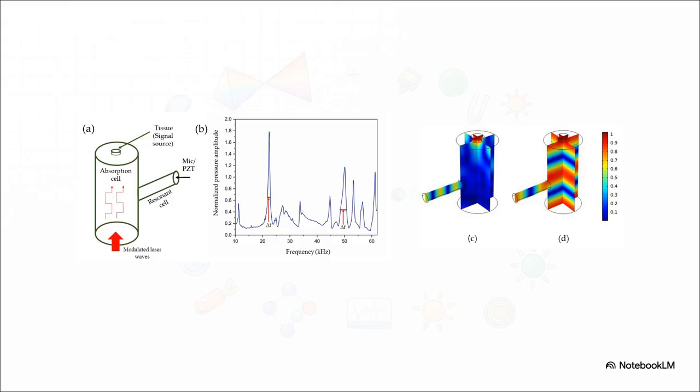We can run these beautiful glowing 3D heat map simulations that show the acoustic modes literally dancing inside the chamber. Those intense red and blue zones? That's showing you the extreme highs and lows of the pressure waves building up. By cleverly designing the geometry of these chambers, analytical chemists can boost the signal strength exponentially. It's how we achieve that mind-blowing ultra-trace detection.